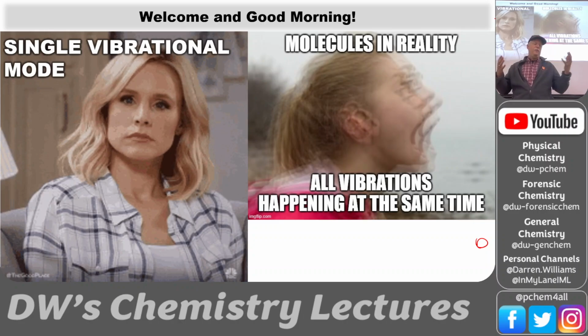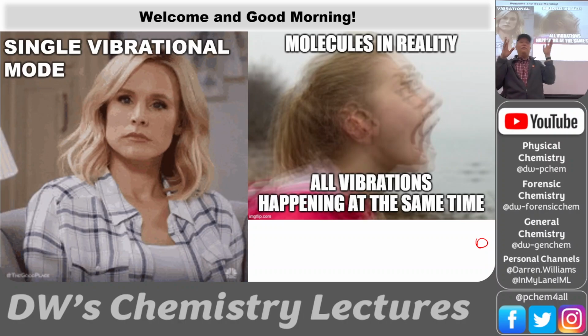So you can think of your body too. Like every motion in your body is like this little joint on the end. That's a vibrational mode, right? I can do that, and it's completely unrelated with what my leg does. Okay, so every vibration in a molecule is orthogonal to all the other vibrations. And so we can talk about them one at a time, like this, shaking your head, but a molecule is doing it all at the same time. So all of them are moving at the same time, and it's chaotic.